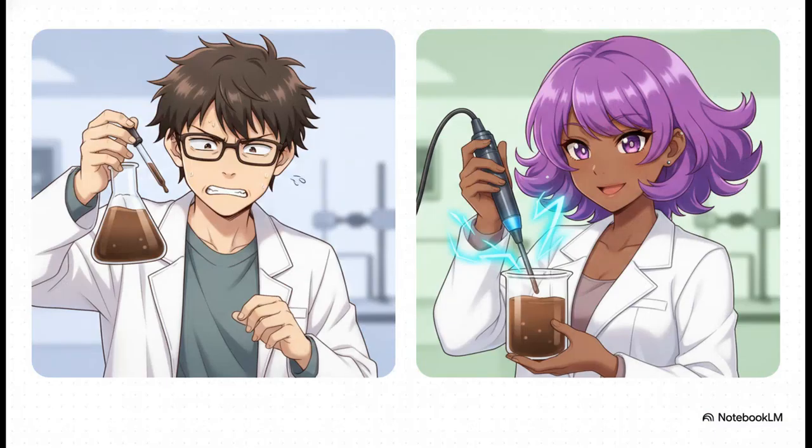So that brings us to a choice between two totally distinct analytical methods. First, we've got traditional volumetric titration. This relies heavily on visual color indicators, which, as we just established, completely fail us in turbid or highly colored solutions. But on the flip side, we have conductometric titration. Instead of looking for a visual color change, this method relies on tracking electricity, electrical conductance, to be exact. It's absolutely perfect for colored solutions, very dilute solutions, or even systems that involve relatively incomplete reactions, like the neutralization titration of phenol, which traditional indicators simply can't handle.